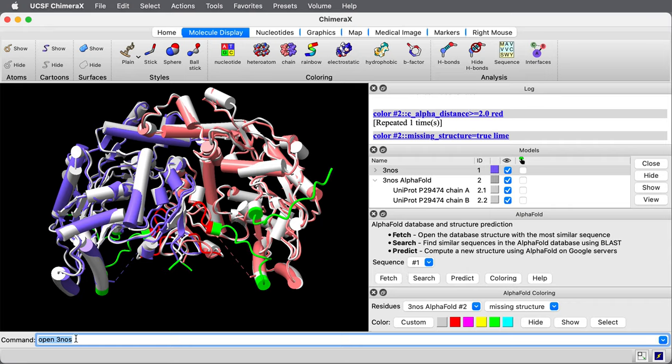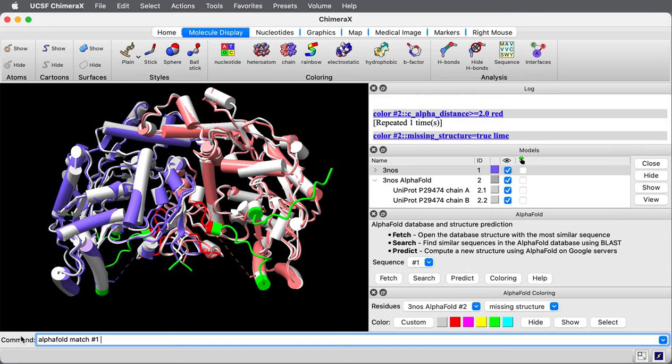That experimental structure was only about 500 amino acids, but the full length of this gene is 1,200 amino acids. To fetch it, I can say alpha fold match number one, and then I have an option. I say trim false. That means don't cut it down to the size of this experimental structure.